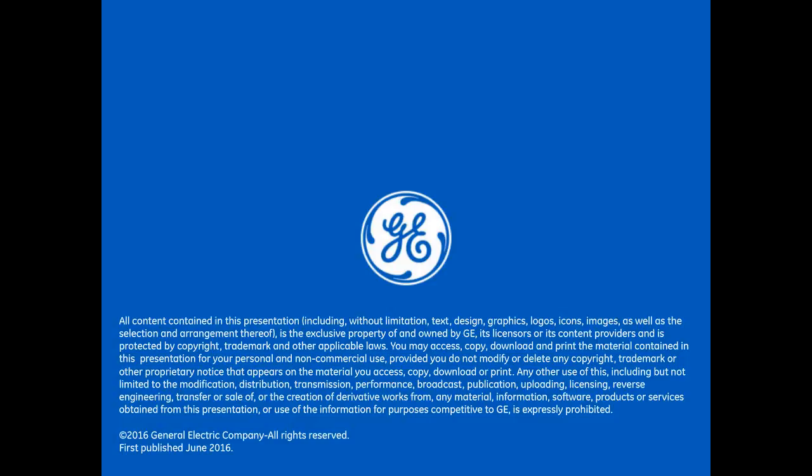The logic might tell you that a Cas9-induced knockout should take longer because you're working at the DNA level compared to RNAi, where you're working at the messenger RNA level. You're kind of further down in the expression pathway. But we actually see that most of our assay time points between RNAi and CRISPR are very similar. I don't necessarily have an in-depth explanation for that, but that is what we observed.